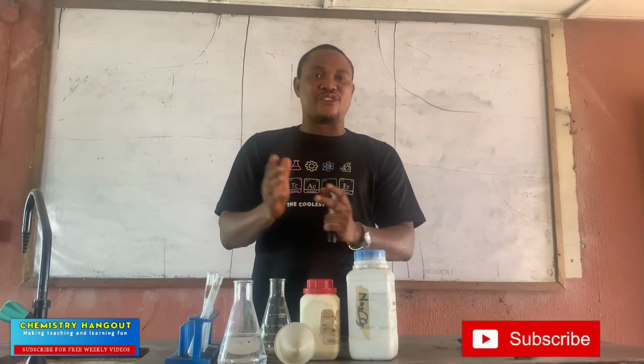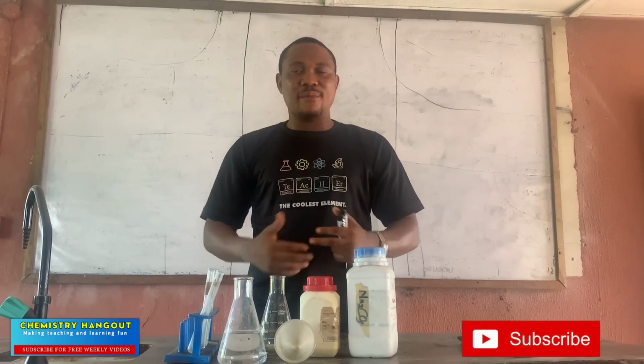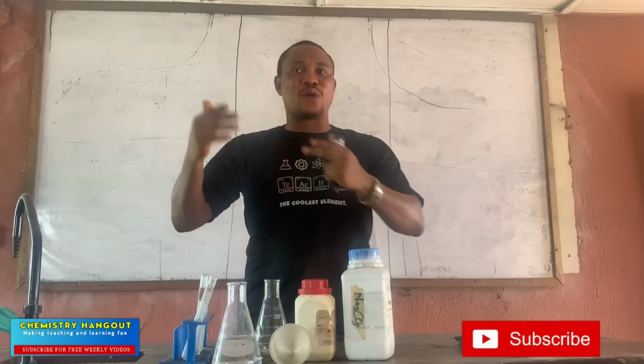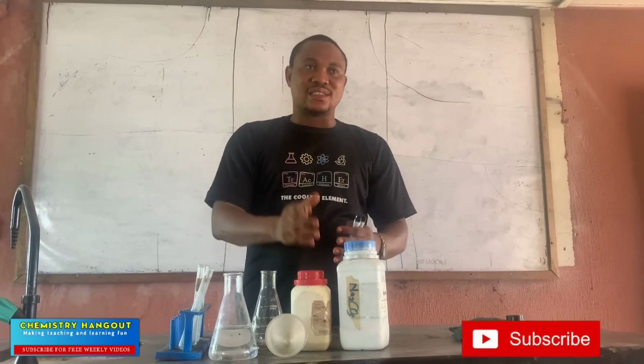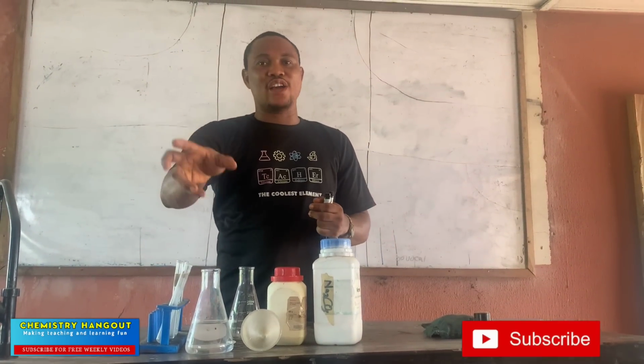But if you still have challenges as regards the preparation, you can reach out to me. The aim is to work together, make us better so that we can actually lead these students to success. So that is what is there. Very important, the titration this year is permanganate solution, and you have iron 2 sulfate.